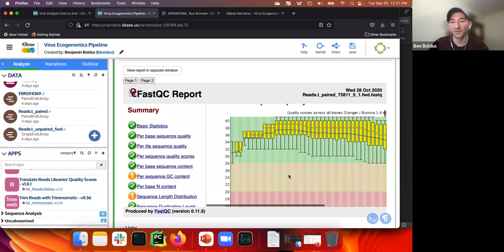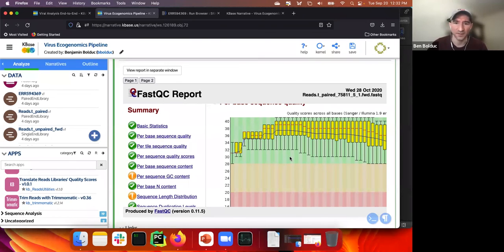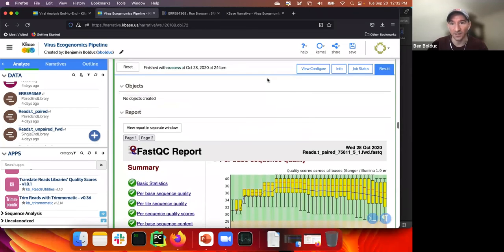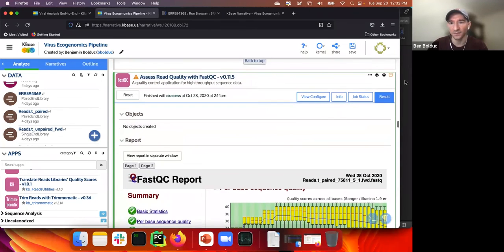If you're in some of the long read sequencing, that is totally a different ballgame. You should definitely look at the documentation for those in terms of their quality, because I know that nanopore data is always getting better and the quality is always being pushed further. And there's a separate set of pipelines for cleaning those reads up.